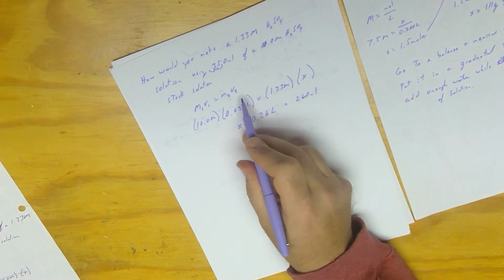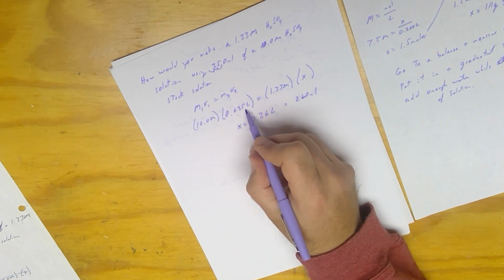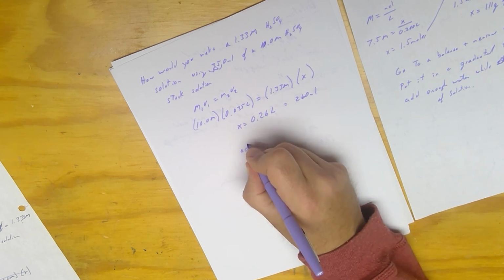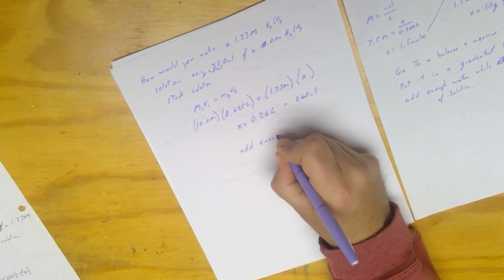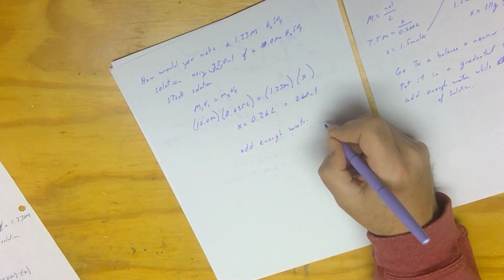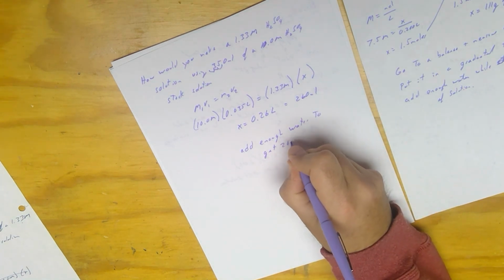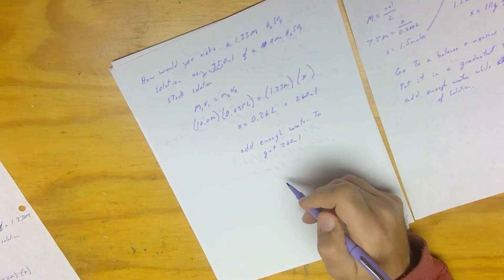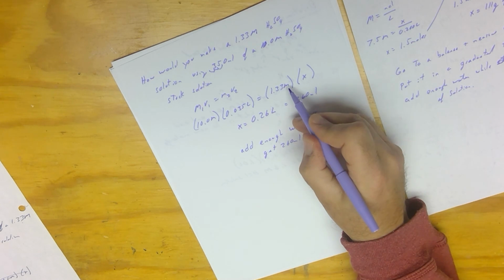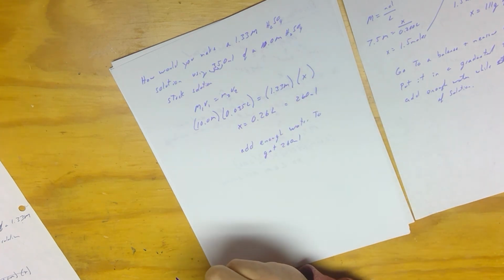So what I would do is take this stock solution, 35 milliliters, and add enough water to get 260 milliliters. So I just add water until I get to 260 milliliters, and that would dilute it down to 1.33 molar. Pretty easy stuff, not too bad.